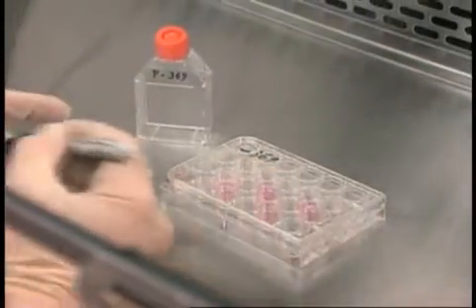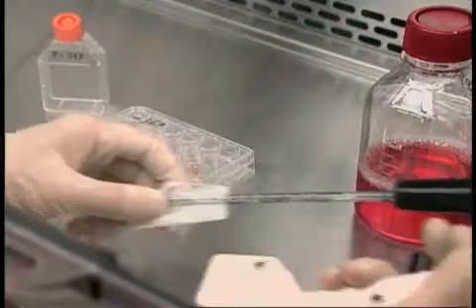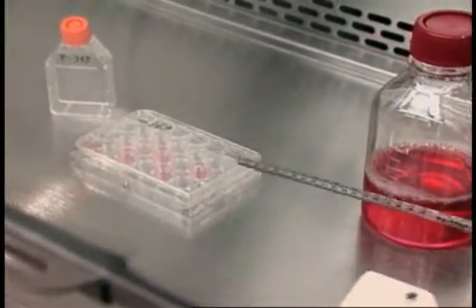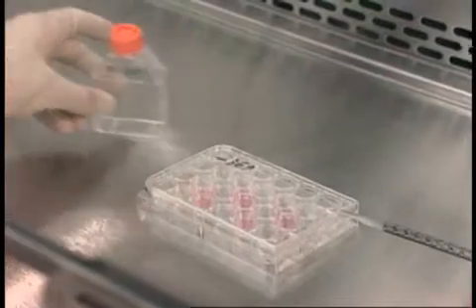Mohammed makes sure that everything he needs is in the hood prior to starting the procedure. Moving in and out of the cabinet increases the risk of contamination, as well as the risk of exposure.